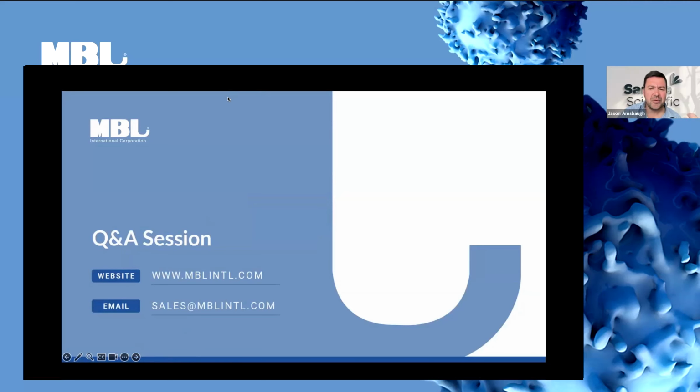Another question: what if the allele that you're interested in isn't offered for QuickSwitch? You'll have to wait. I'm sorry. It's not a simple process, and not necessarily the discovery itself. It's just the testing to make sure that it works in multiple conditions. We're working on it. I know that some people are asking for other alleles, but it's a difficult process.